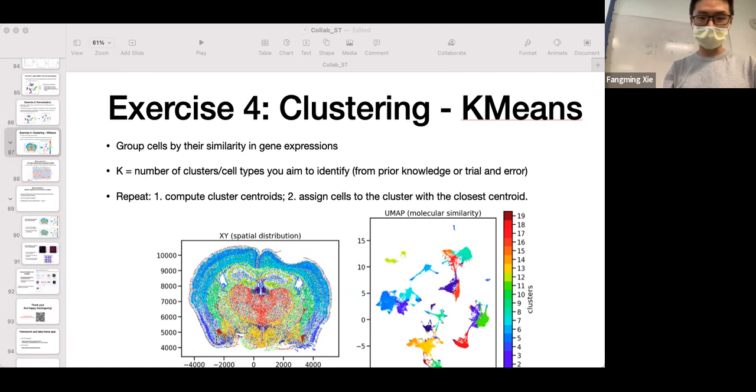It's quite straightforward. The idea is we want to take the centroid of everything. Actually, let's start from 2 pieces of information. One is our normalized features, or the raw features if you want, but I'm sticking with the normalized features: for every cell, the expression level of every gene. The other is our cell type. For every cell, we have their cell type label, 1, 2, 3, 4, 5, etc.